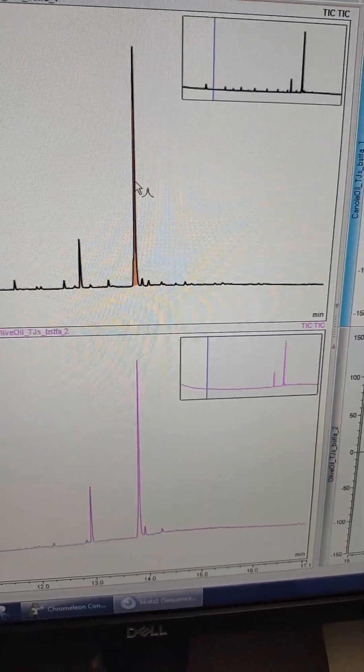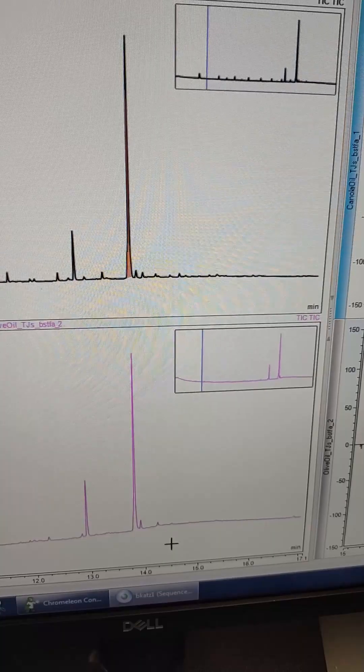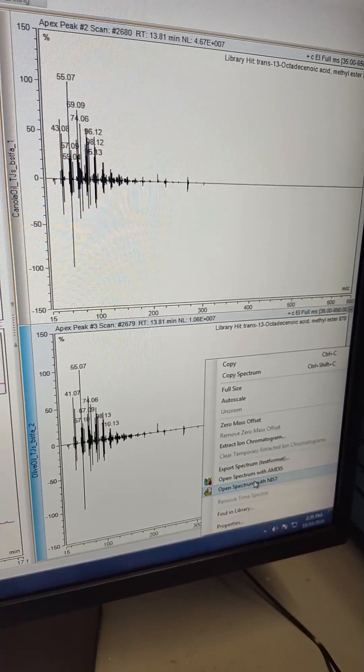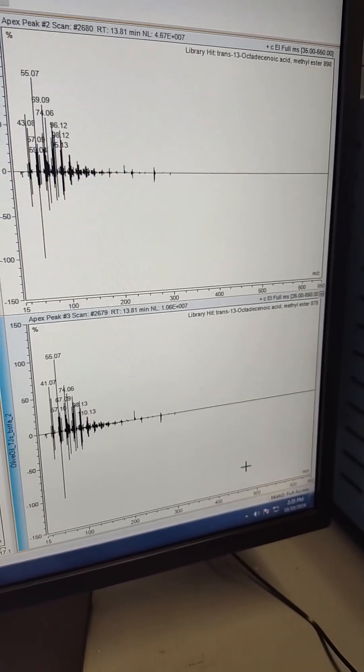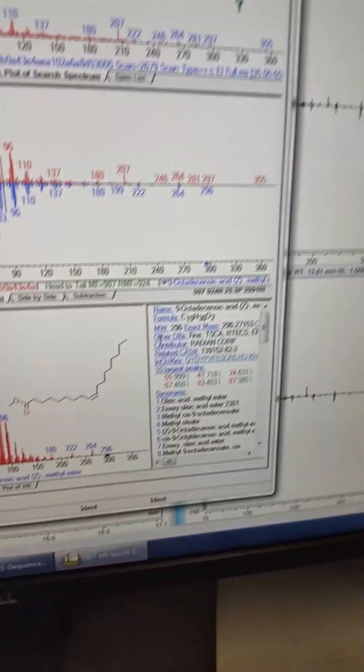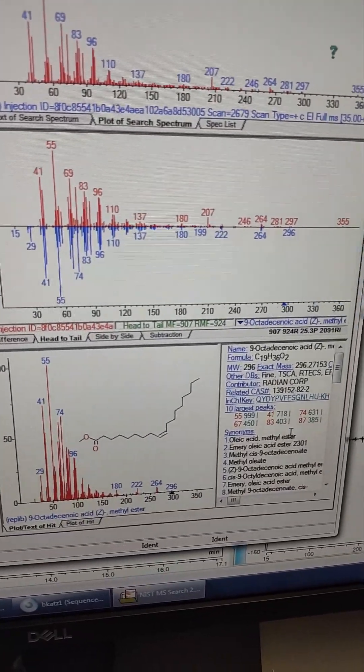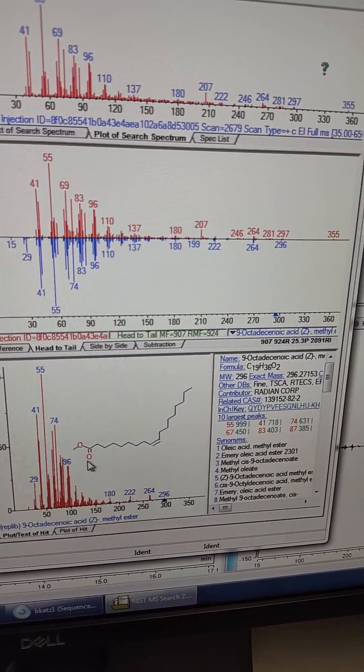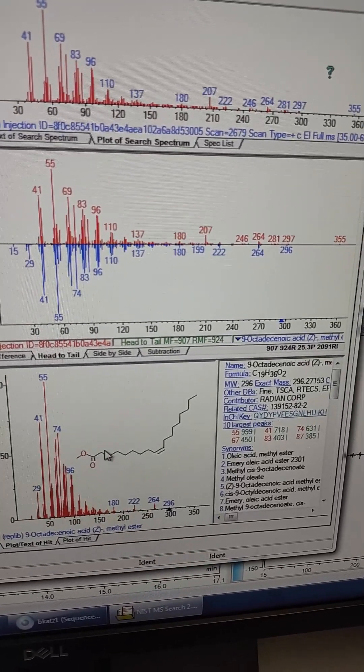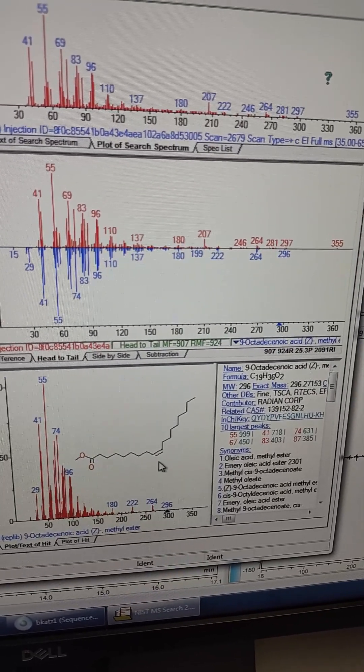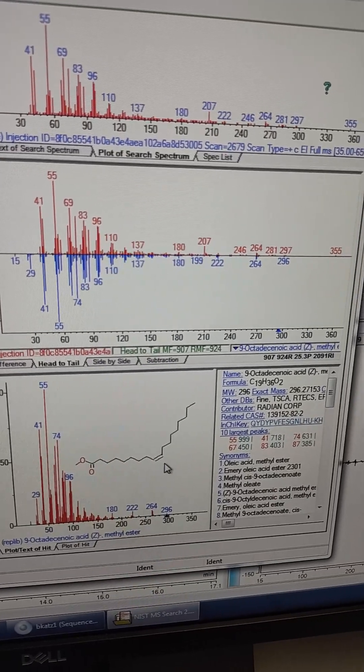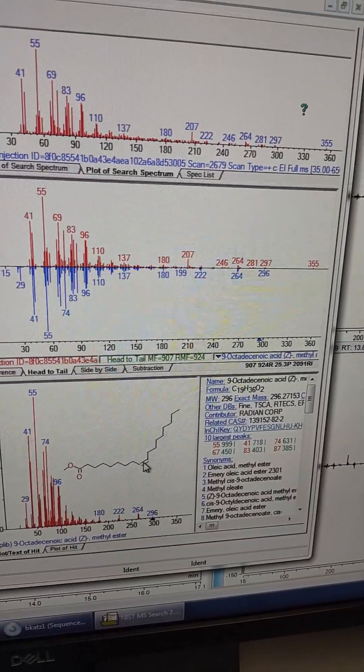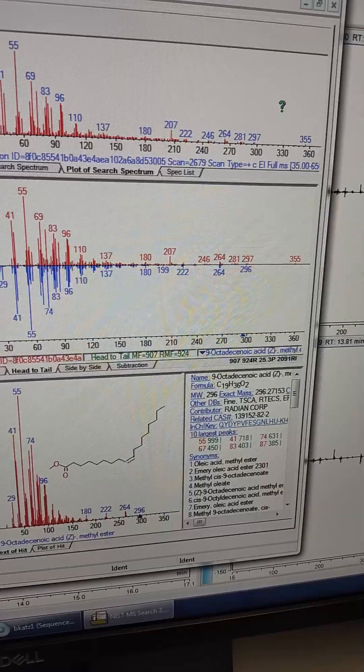But so we're looking at the olive oil. There's a peak in the olive oil and a peak in the canola oil. They're at the exact same location and give me the exact same mass. And the hit in NIST is oleic acid. And again, it's the methyl ester because I methylated this ester so it didn't have the free fatty acid. So I can confirm that there is oleic acid there. It seems like it's the C9 oleic acid.